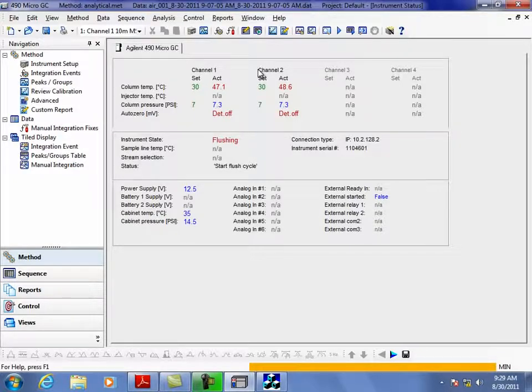If they have to do it, fine. It's not the way I would do it. Depending on the type of flow you had or how much flow you had, you should always have enough flow to get through this system of pressure. In other words, inline connection is the best. Absolutely. Or maybe even a Tedlar bag or something.